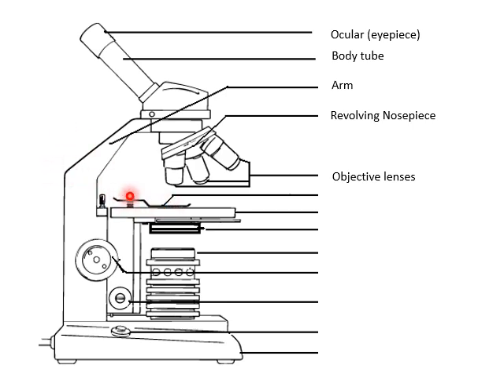Actually, sometimes the little clip that's on there is really annoying because you want to move the slide around, then the clip holds it down. But it's also great because sometimes you don't want your slide to be moved around and the clip holds it down. But this is called a stage clip, or stage clips. There's one on each side of the stage. So they're just going to hold down the glass slide that we're going to use.